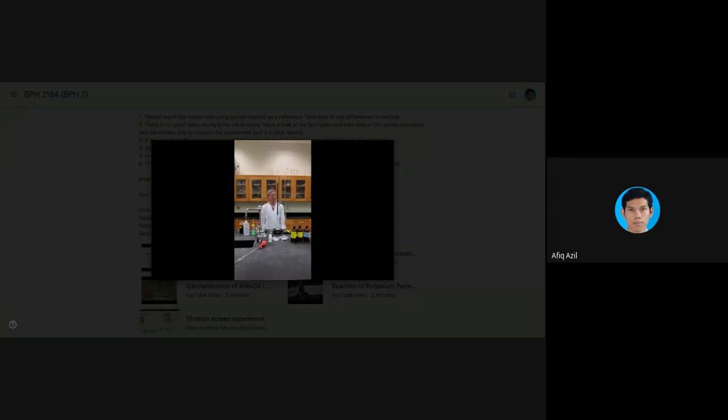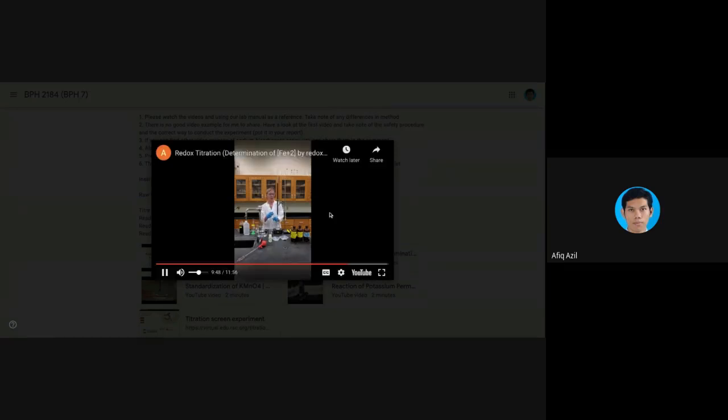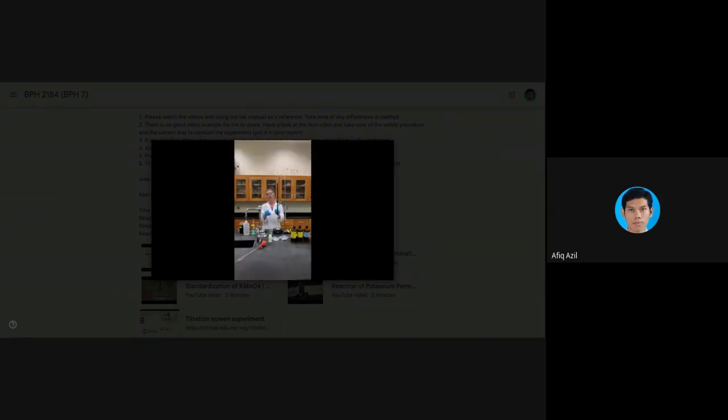Now sometimes the iron ion can be a little finicky and kind of show you a yellowish at times. But push through that, you're looking for the palest purple, which, because we're adding purple, if it goes a little yellow, it could at times look peach, but you are looking for that pale purple. I will demonstrate that in just a moment, a little closer, so that you can see what kind of purple we're after.